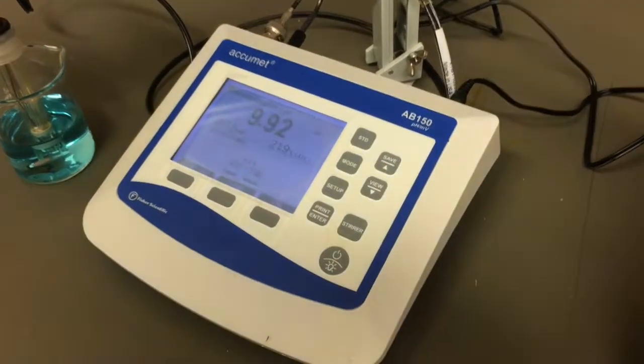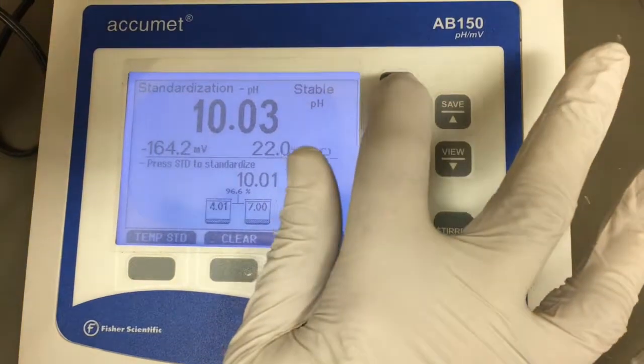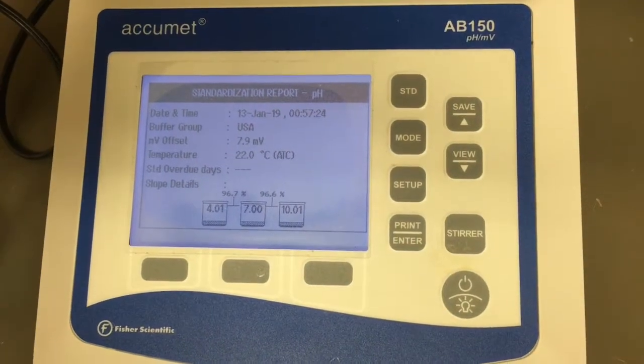Once calibration is successful, you can begin measuring the pH of your desired solution. The Acumet AB150 generates a report confirming the successful calibration of the machine.